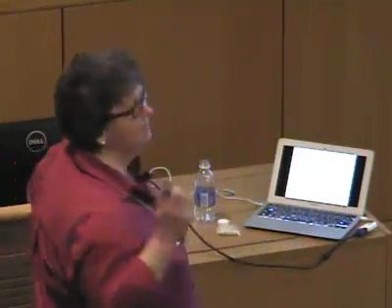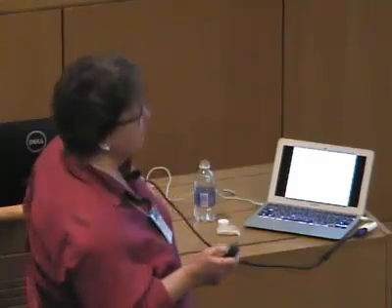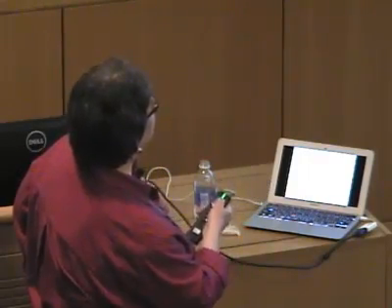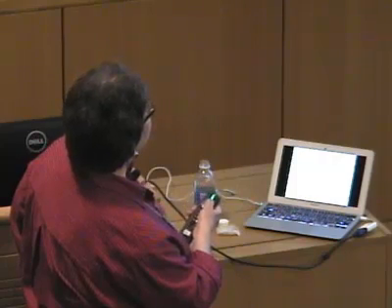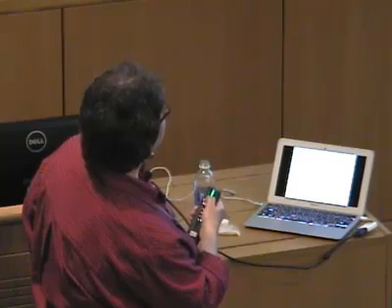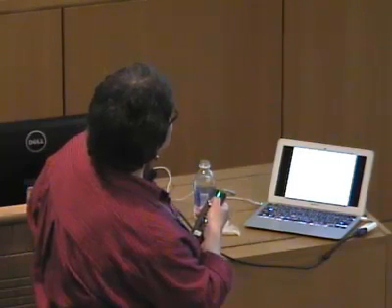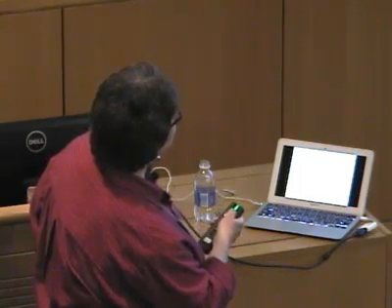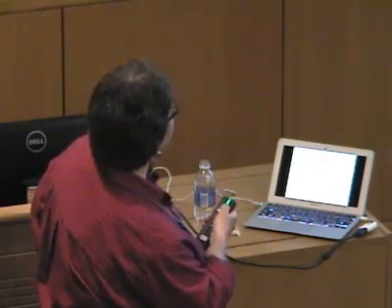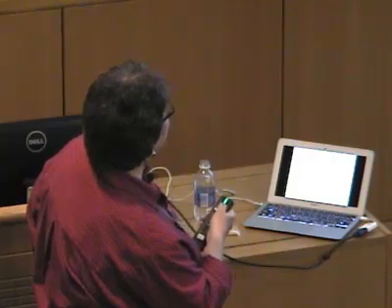I'm going to give you a couple of practical examples. This is a very simple one, but I think it's an important observation. This was a BLAST that I ran a number of years ago. It doesn't matter when I did it. I took that phosphonatase sequence and I ran it against the database, against SwissProt, and it gave me a hypothetical protein at a not quite statistically significant value, or close to statistically significant, but not a high quality value.